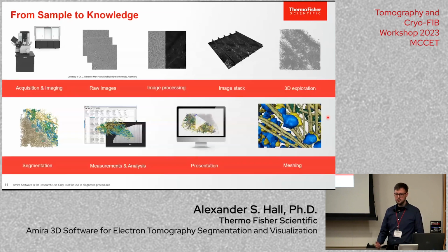So that's what's specific, I would say, to cryo-electron tomography. Kind of zooming out a little bit, Thermo has a full range of tools. As you know, we're using the hardware and the software that comes with the microscope itself. Amira is an offline tool. So you can do this data processing at any point.